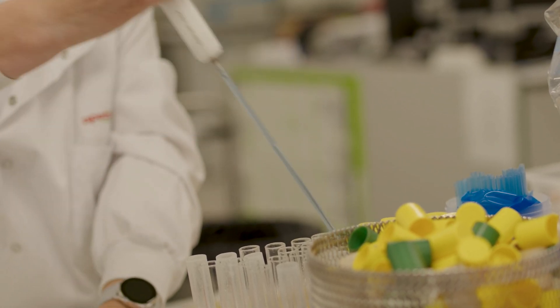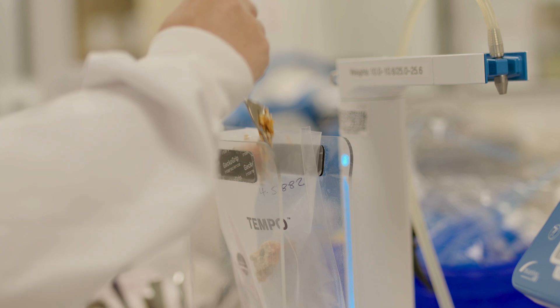Here at Apetito, we have our own on-site laboratory facility which includes three different areas: microbiology, allergen testing, and nutritional testing.